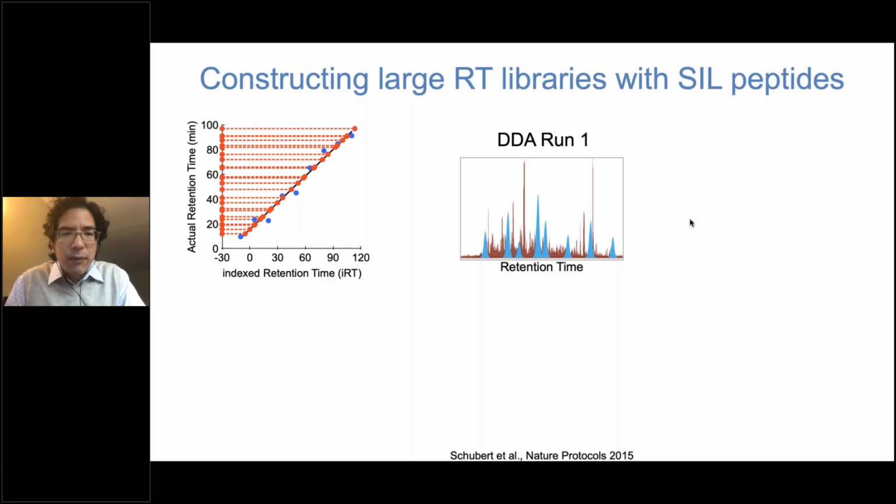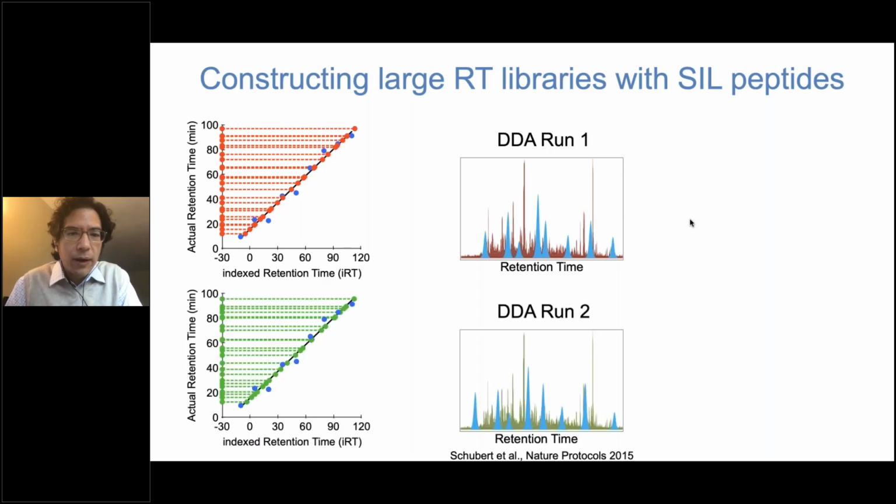So this derives what are called index retention times, or iRTs, for each of these different precursors. They're estimates for their retention times, a reasonable estimate for what they should be. And the other aspect of this is they can be on a fairly arbitrary scale. So the iRT scale, for example, descends into negative space, negative time, and oftentimes has much larger values than the actual retention times in minutes in your actual experiment. And so this strategy actually works fairly well if you're doing back-to-back DDA versus DIA runs for building libraries, but it's not very deep, and it also involves a lot of extra work.